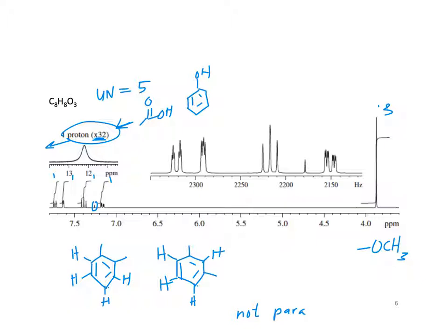So we see a big triplet here, right? These are like a doublet of triplets, right? And then on the reverse side, the second order, over here, you have doublets of doublets, it looks. Even doublets of doublets of doublets, it looks like. It's pretty weird. And then this one, what about that? Looks like maybe a doublet of doublets or something.